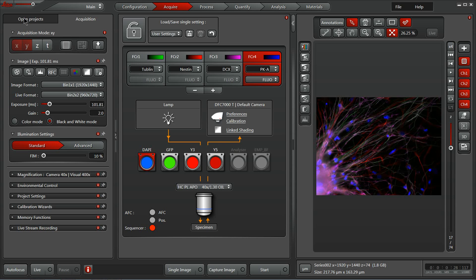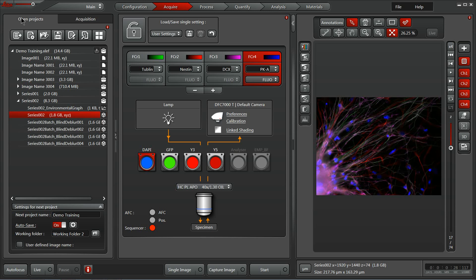Starting with the Projects tab, this is where you can navigate through acquired projects or open new projects. A project is simply a collection of images or experiments.